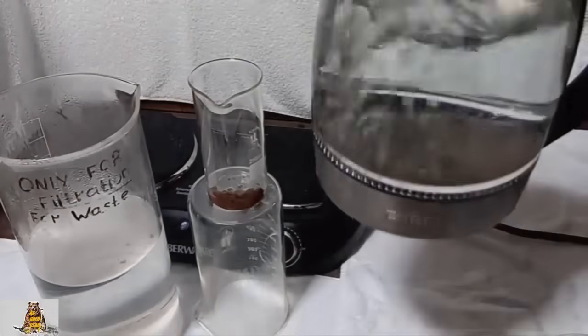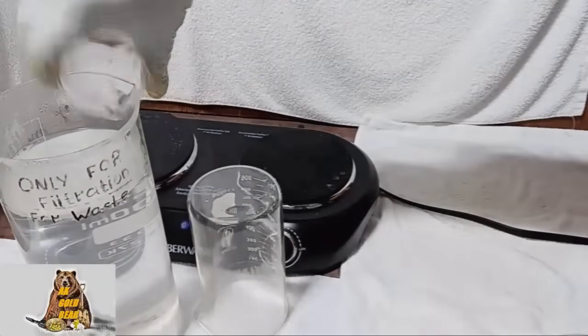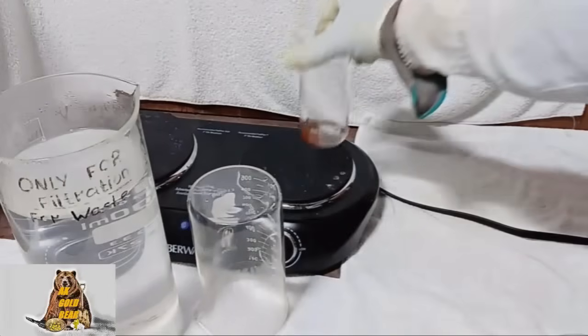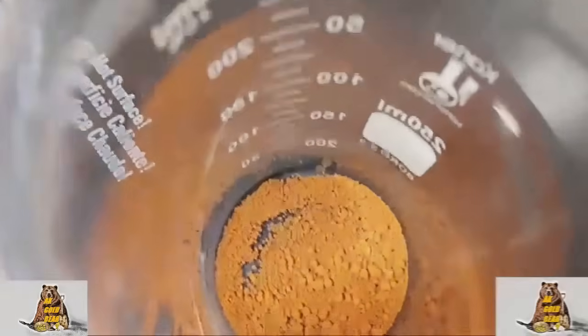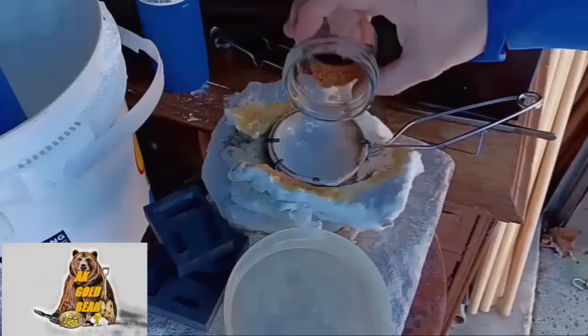Hot water. Awesome color. Now I need to dry it. Three stages of purification, and now my gold is absolutely pure. Hot water.